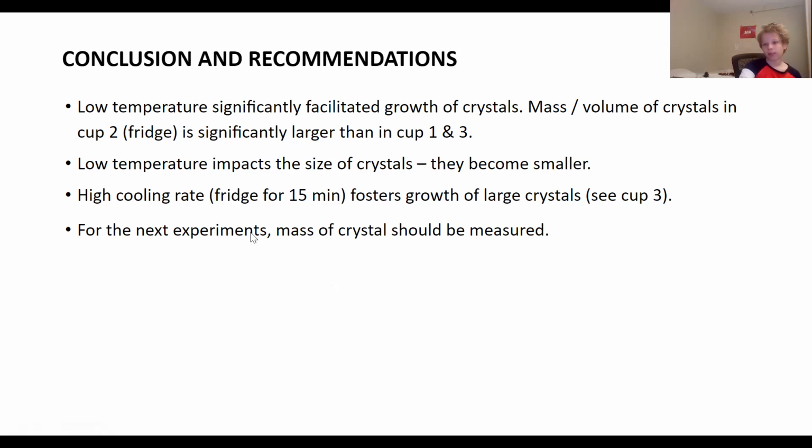For these next experiments, I would like for the crystals' mass to be measured.